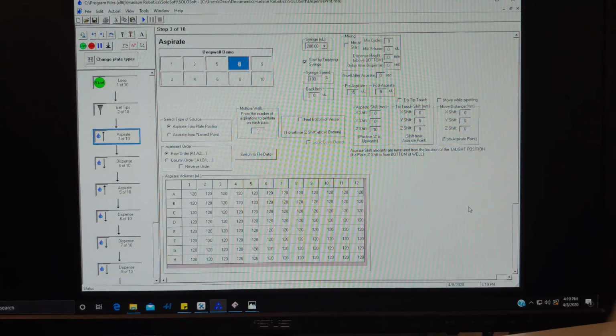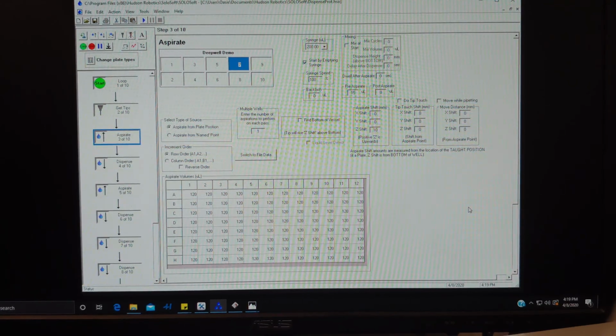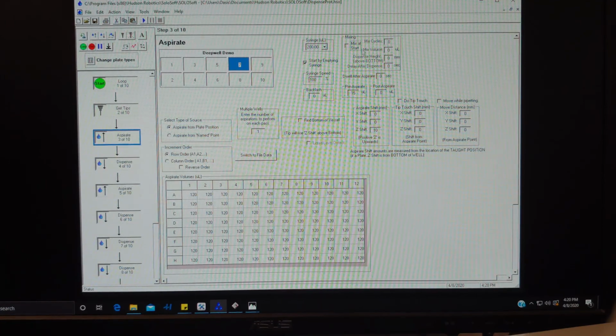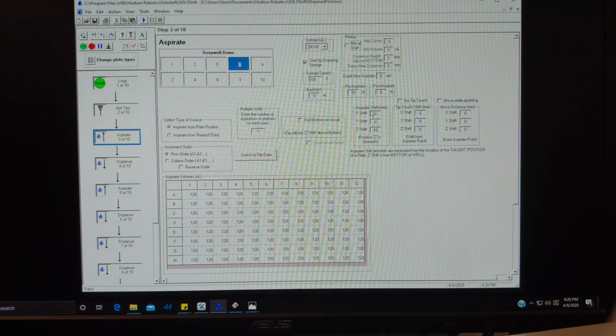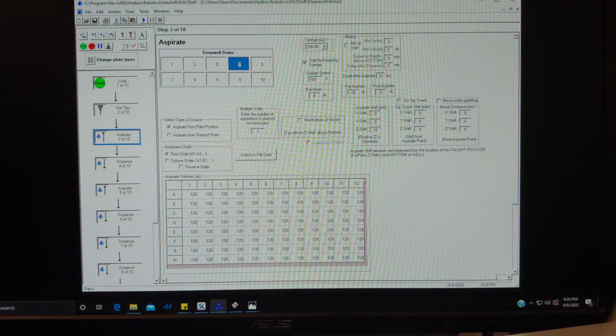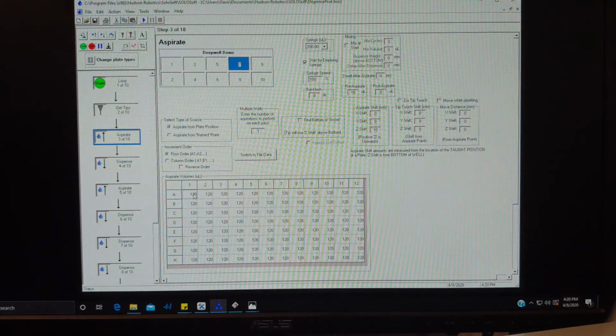Aspirate and dispense are liquid movement commands. Aspirate retrieves liquid into tips, and dispense expels liquid from tips. Liquid can be moved from a plate or vessel. Multiple options for both aspirate and dispense are available, including but not limited to mixing, pre-aspirate and post-aspirate of air, changing speed of dispense and adding location offsets at the action point, movement while pipetting, and reading files to figure out the volumes of a plate for cherry picking or hit picking.